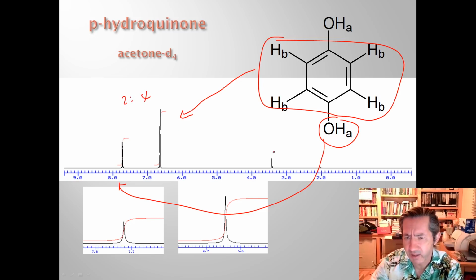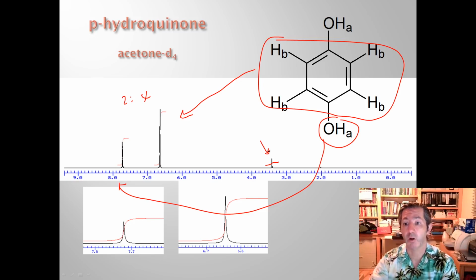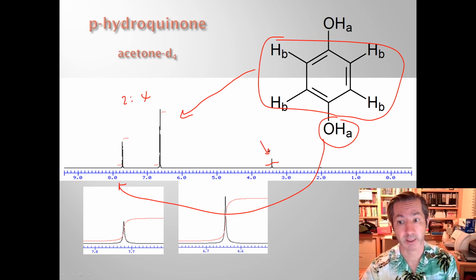And usually when you have these solvent peaks that you have to ignore, if you happen to see them integrated, a lot of times what gives them away is the integration will be like really, really tiny right here. So if you have like a 4-to-2 ratio and you have something that's integrating for like 0.001, then usually you know it's a solvent. Or the spectroscopist may point it out and say that's your solvent. So that's a little bit about the peak area. And so already we're starting to get a lot of information from these peaks from this NMR spectroscopy. But I'm going to show you how you can get way more information.